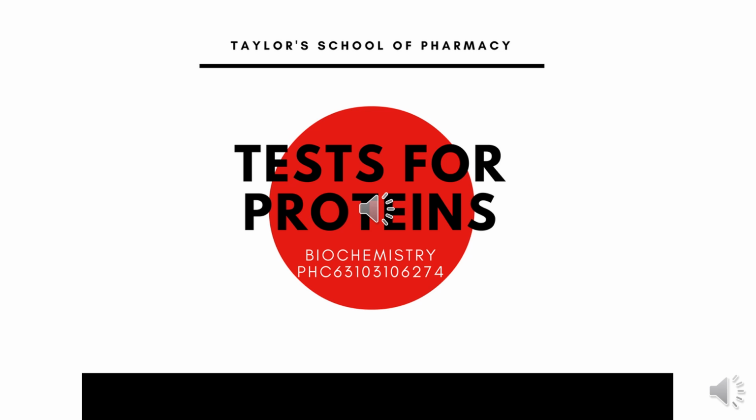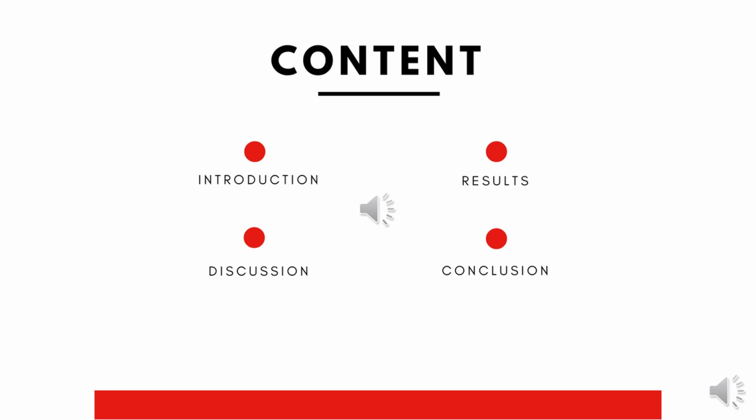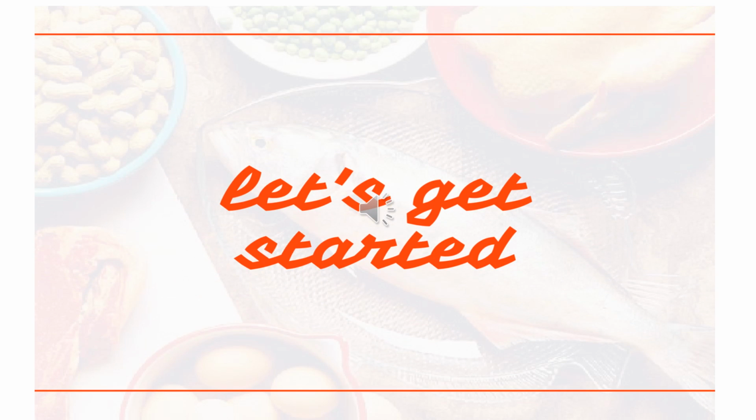Tests for proteins. The contents for this video are introduction, results, discussions, and lastly, conclusion. The content. Alright, let's get started.